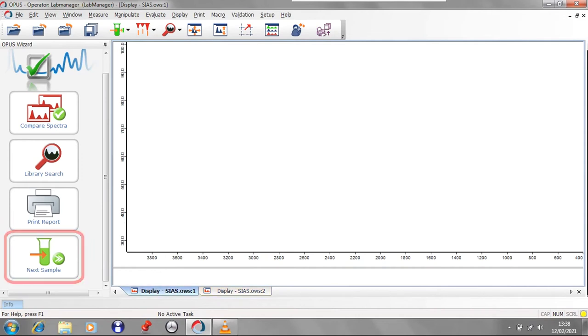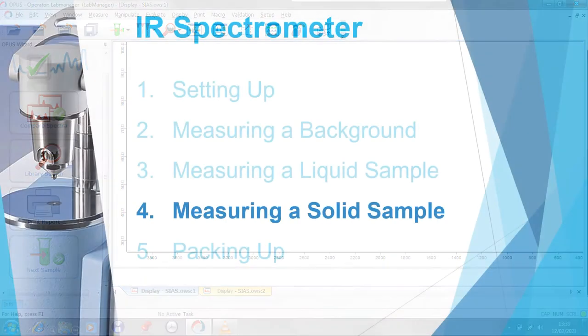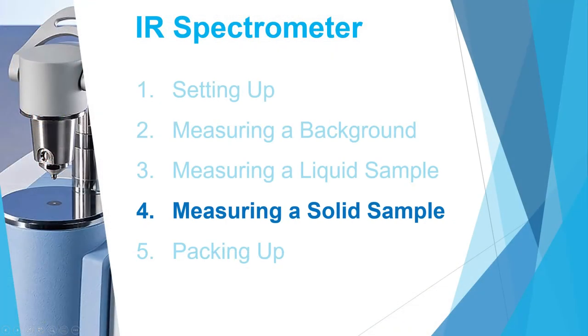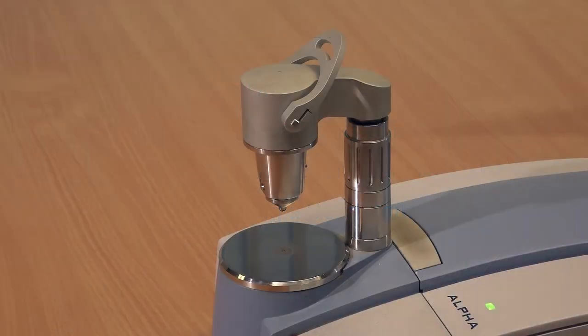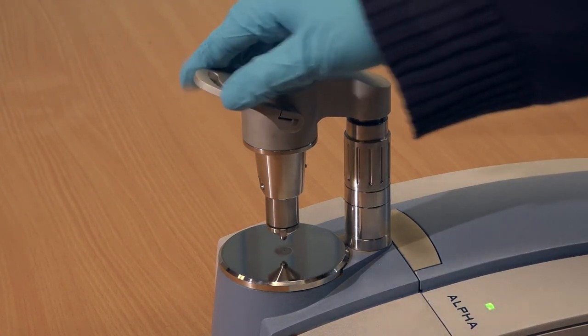We will do this now but with a solid sample. For solid samples, the arm must be in contact with the sample, pressing it firmly down onto the lower window. Push the upper handle forward. If it doesn't touch the plate or cannot go all the way forward due to being too low, you need to adjust the arm.